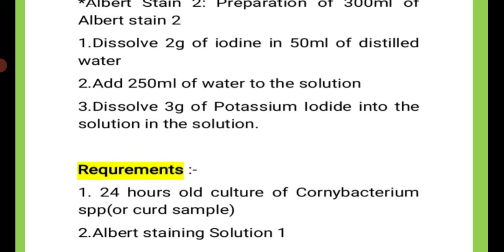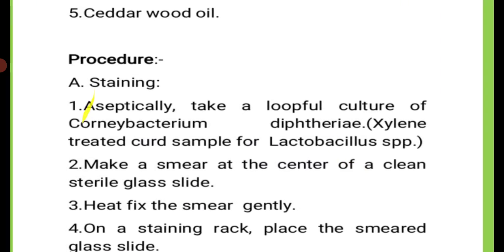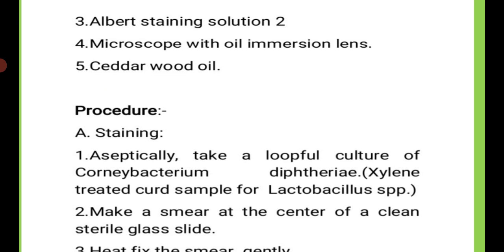Then the second requirement, Albert staining solution first, Albert's iodine or Albert's staining solution second, a microscope with oil immersion lens, and cedar wood oil.